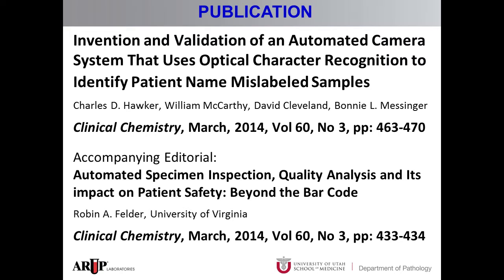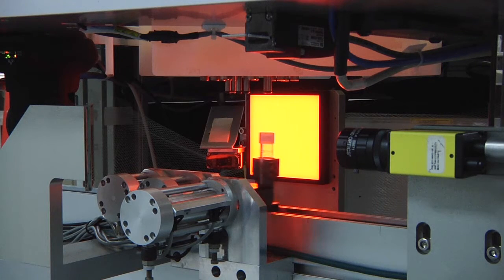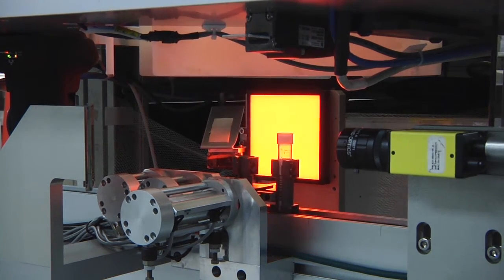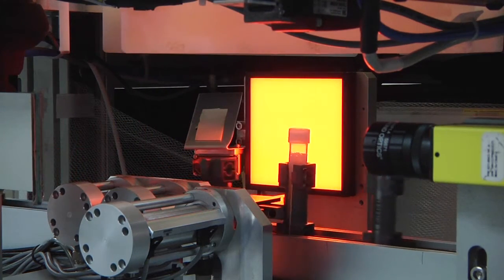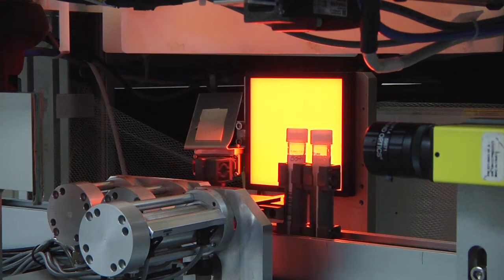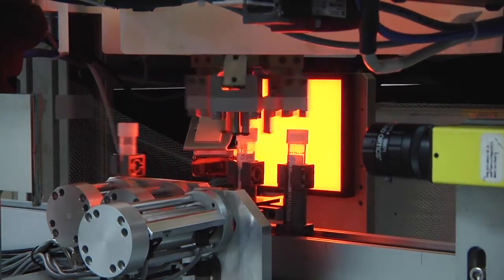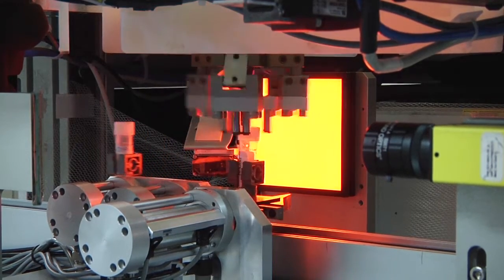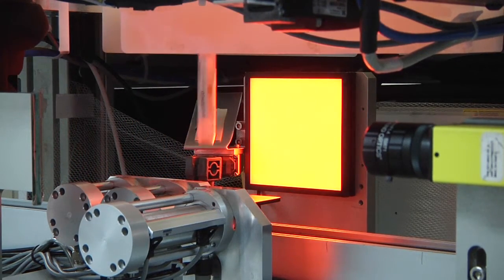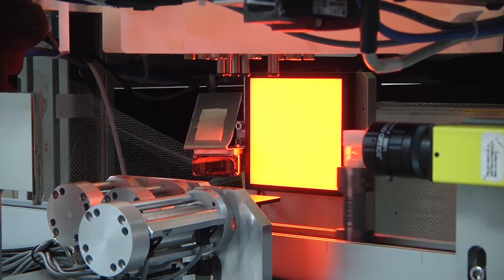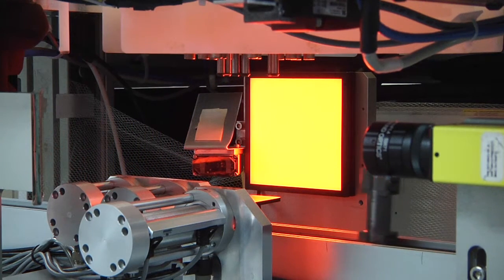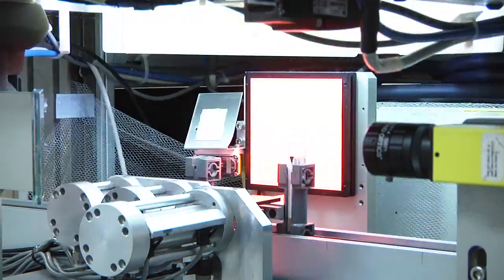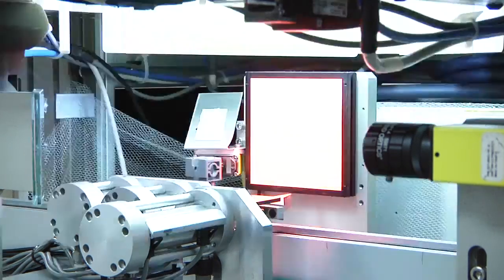This video clip shows the operation of the system that was developed to detect mislabeled specimens. As shown in this scene, specimens are being transported in carriers on our automation system. They are stopped at a precise point, enabling a robot to pick the tubes out of the carrier and lift them up to the vision system. This stopping point is directly in front of a red backlight, and with the aid of a 45 degree mirror, a smart camera — shown in the right foreground — measures the tube's height and the diameter of the cap. This enables the robot to securely grasp the cap and lift the tube.